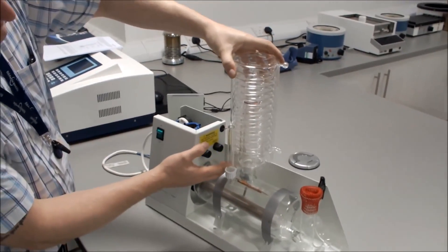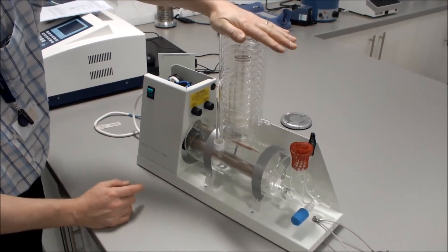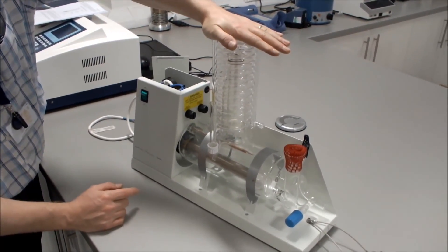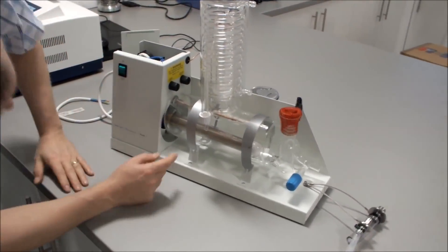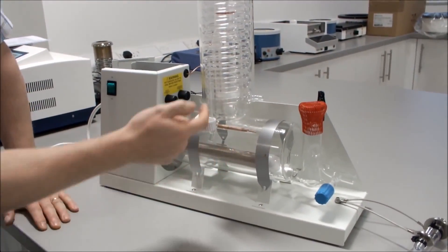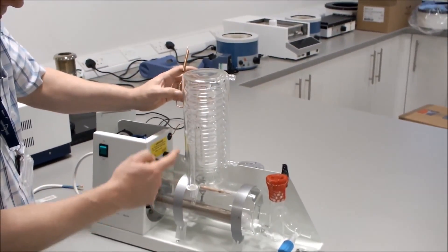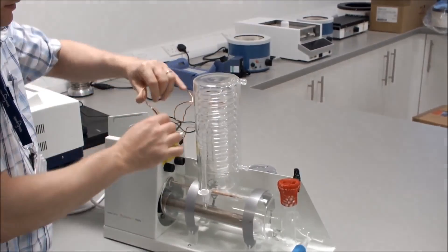Connect the condenser from the top, ensuring the distillate output is at the front. When it is on you will feel a slight resistance — press down slightly to create the seal at the top until you have about a 5mm gap between the boiler and the condenser. We then connect our condenser thermostat into our condenser thermostat tube.